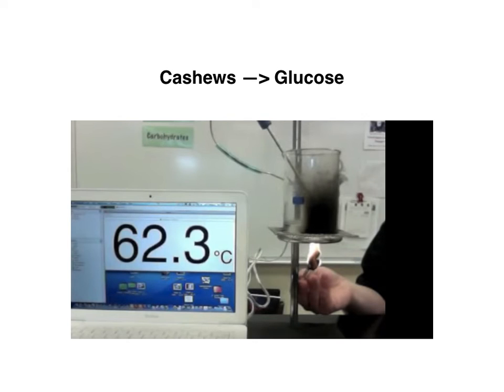In this video experiment, Mr. Bingaman is your lab partner and you will record the data. It is a video experiment because we are setting fire to the cashews.